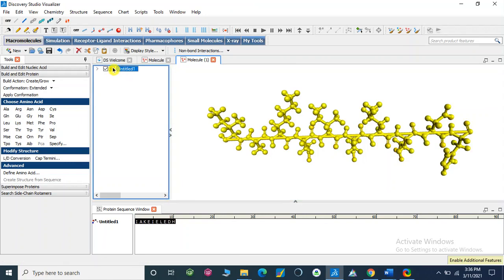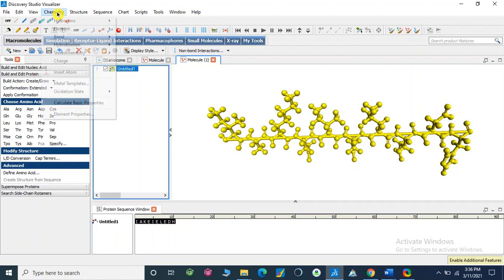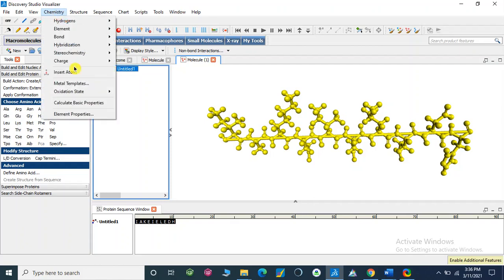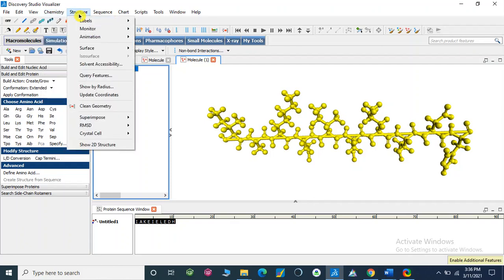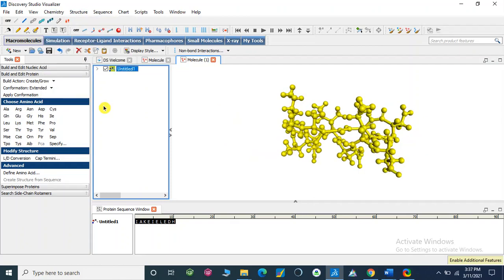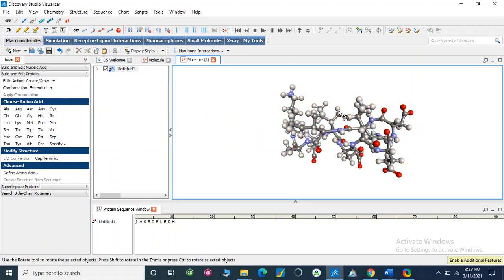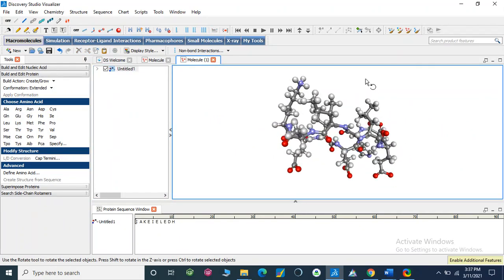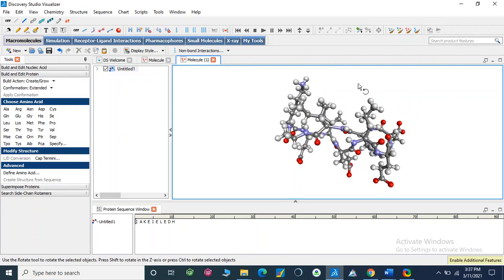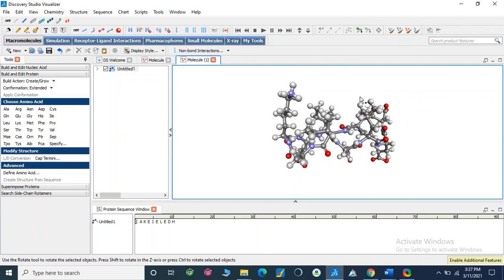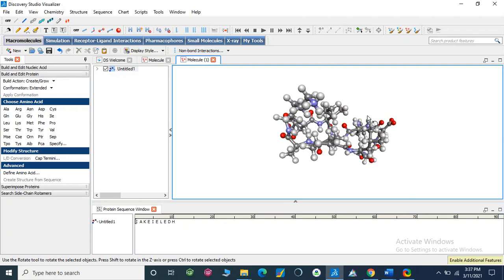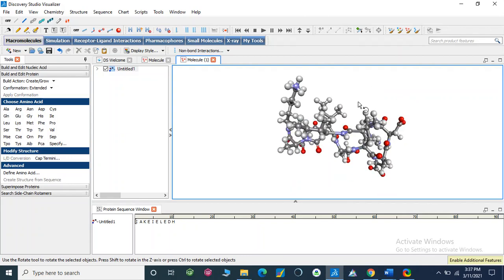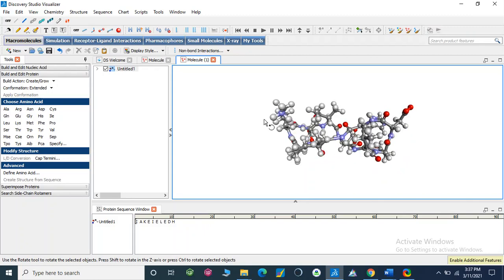Go to Chemistry, Structure, Clean Geometry. This is our cyclopeptide. If you look at here, it is our complete cyclopeptide which we want to synthesize.